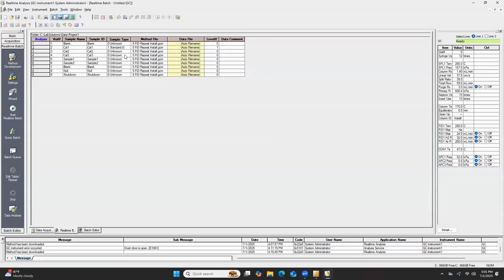Explain it differently, that may help you better. You know. So, like I said, I'll give you guys that. I know that computer should have that document with some of those I videos. I will share this with you. Okay. Yeah, and there's also some additional videos that are just GC specific that I'll give you guys first.